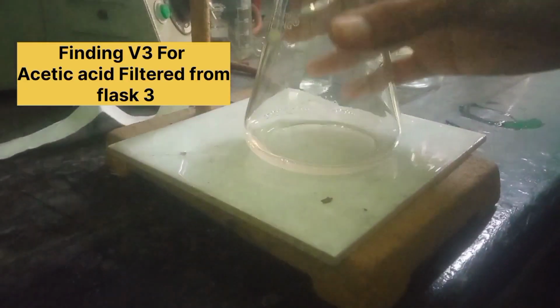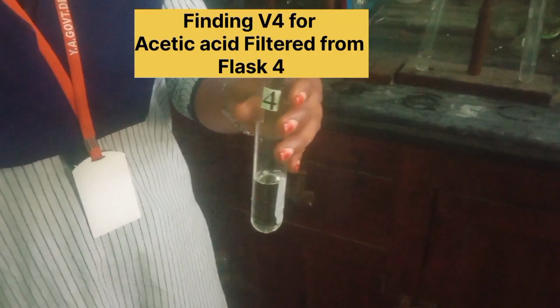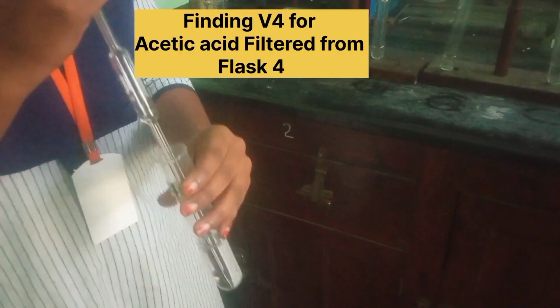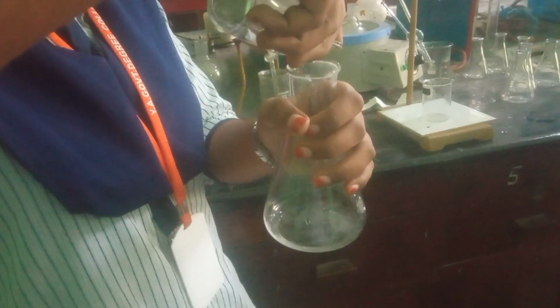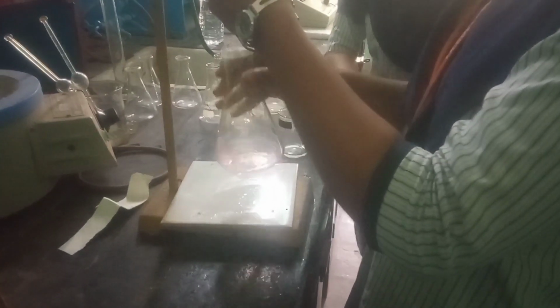So after getting values of C1, C2, C3, C4, C5, now the student can calculate the difference between initial concentration and C1 and C2, and initial concentration is to be a reference value for that.